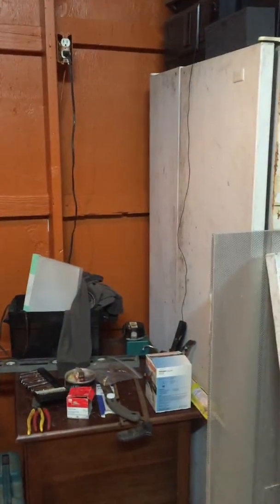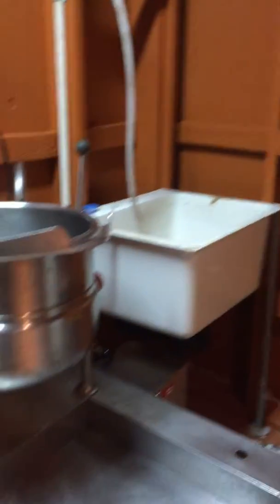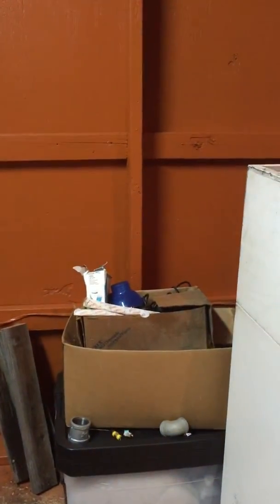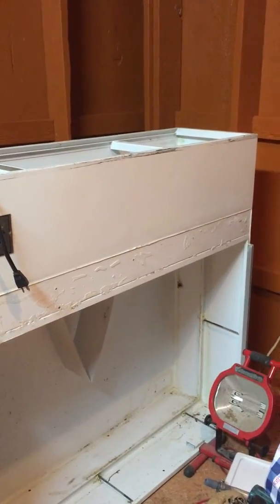Then we'll have our fridge over next to the flow hood. I want to put the cabinet up there and put the autoclave under the cabinet. So the workflow will be: grain boil, grain dry, grain bag, cart it over into the autoclave, and once it comes out of the autoclave it goes onto the laminar flow hood.